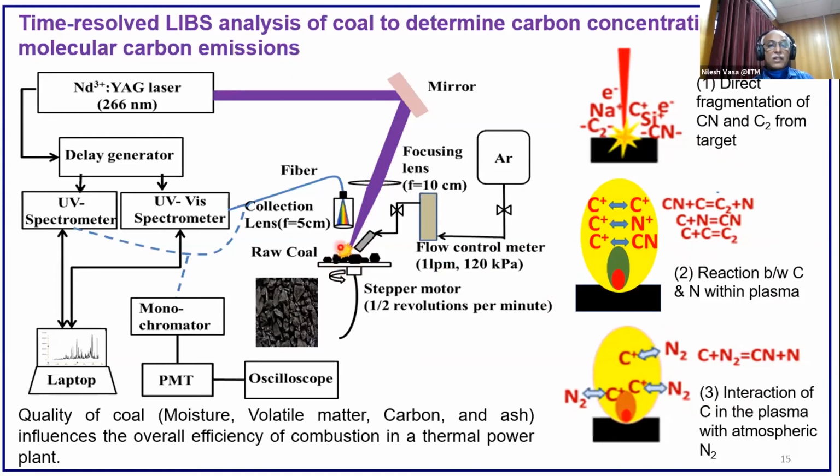In order to track this, can we use a particular ambience? Of course vacuum might be a very good idea, but it's not a good solution in online measurements. So the approach should be that we can do online measurement and at the same time capture the carbon information.